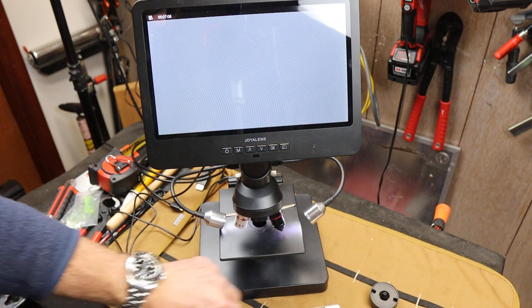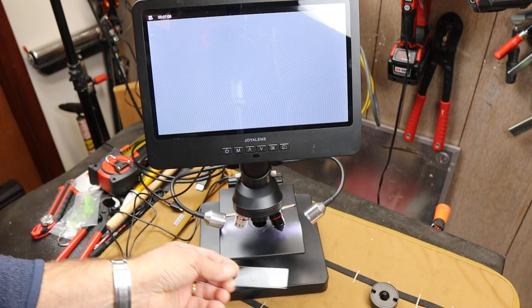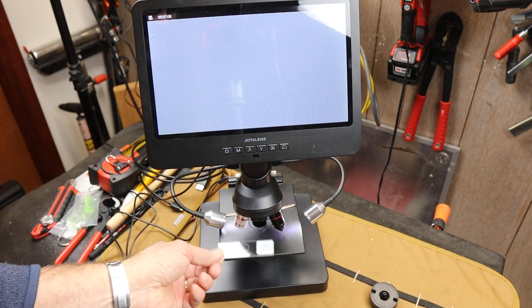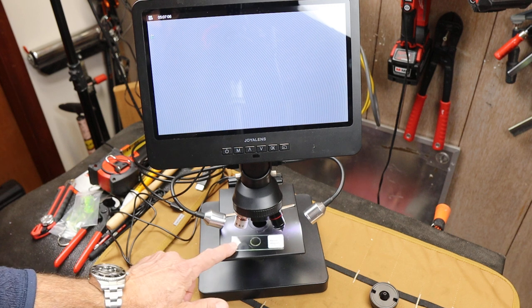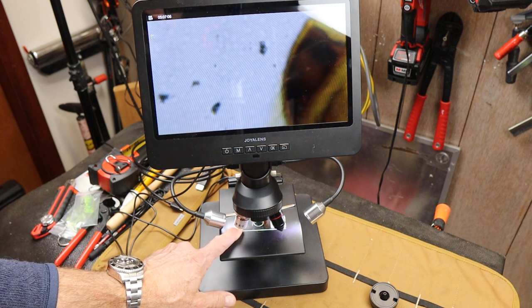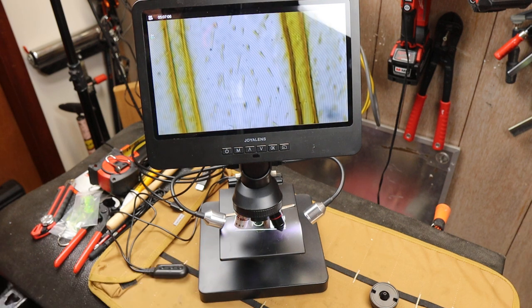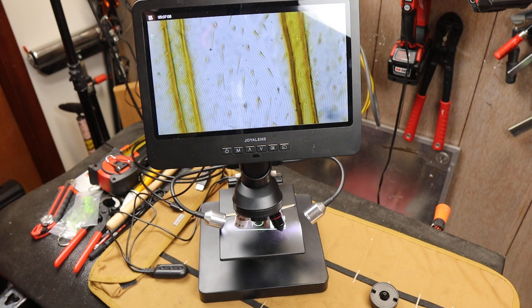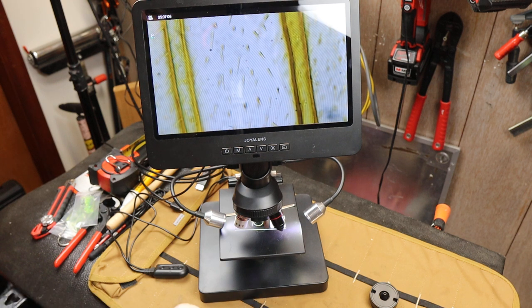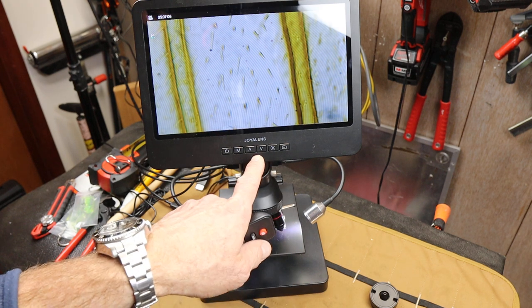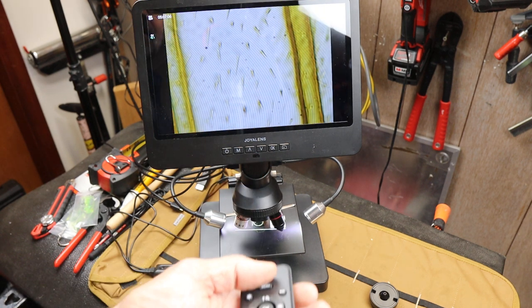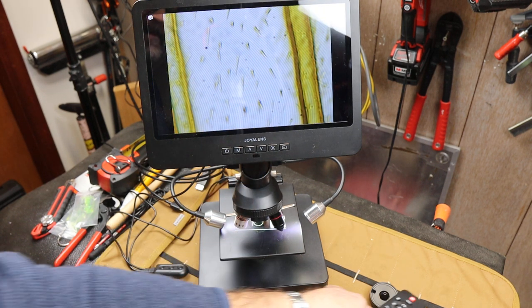If I went into a, here's a honey bee wing. Let's see what that looks like. If I can just slide that in, because it's already set. There we go. That fast. Want a picture? Take a picture. Got to hit this little dot there. There we go.